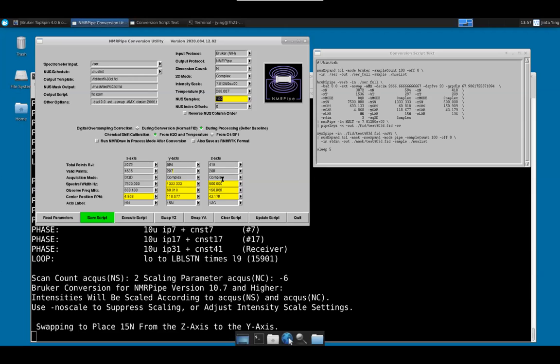Yes? Sorry, can you check this using the user interface in Topspin?